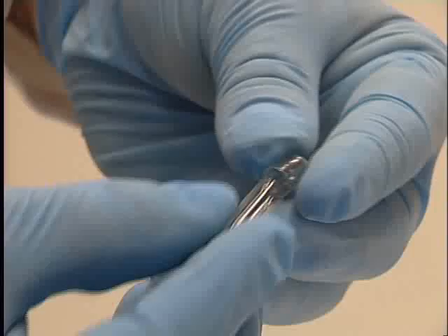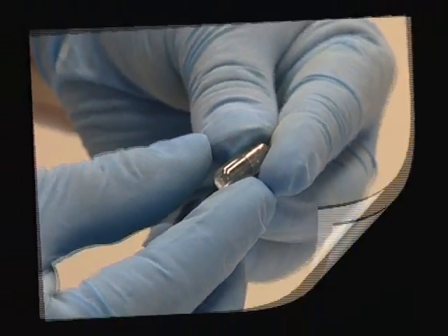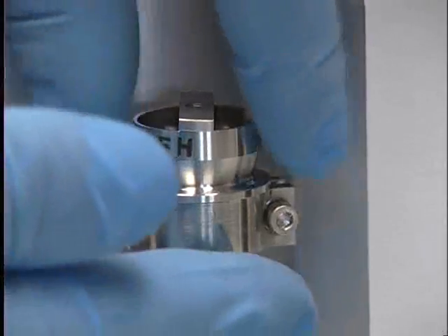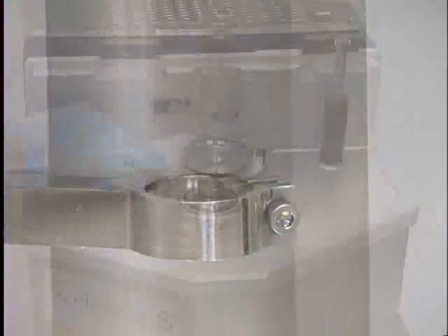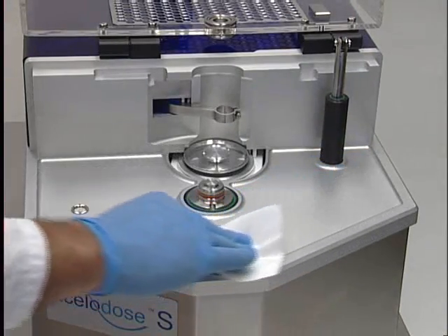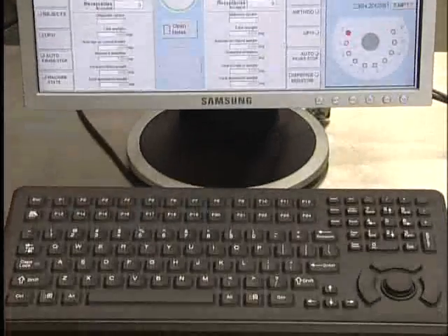Once removed from the system, each accepted body is capped and the cycle is complete. After a run, parts can easily be removed for the clean down process. An IP65 keyboard is available as an option.